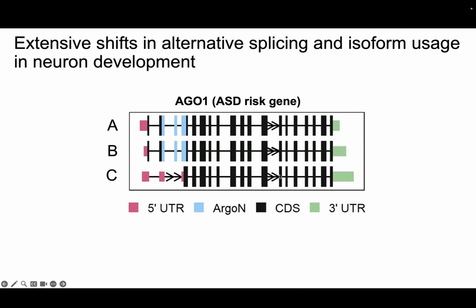And isoform C is similar to A and B, but it's missing this 3rd exon, and it also has different UTRs. And because it's missing this exon, our open reading frame calling tool predicts that the open reading frame actually starts here in the 4th exon.